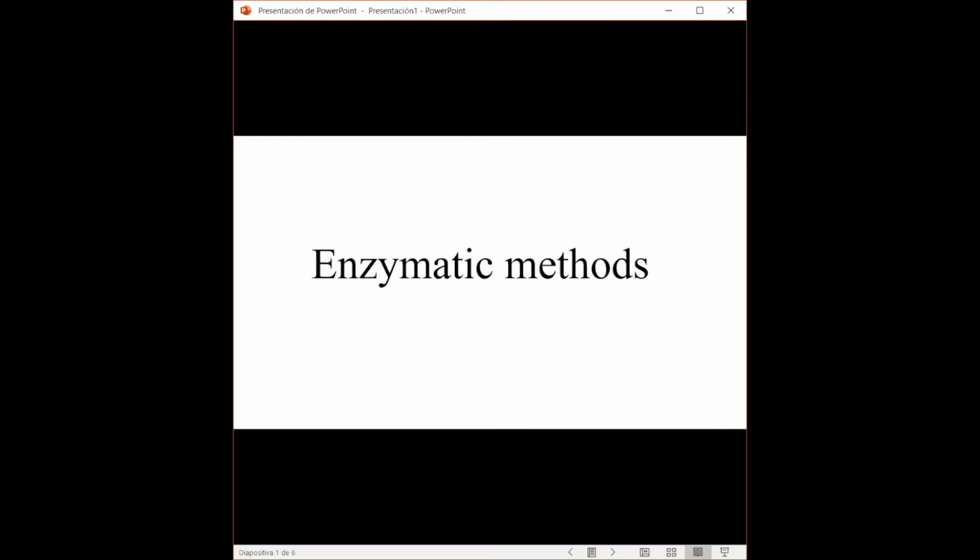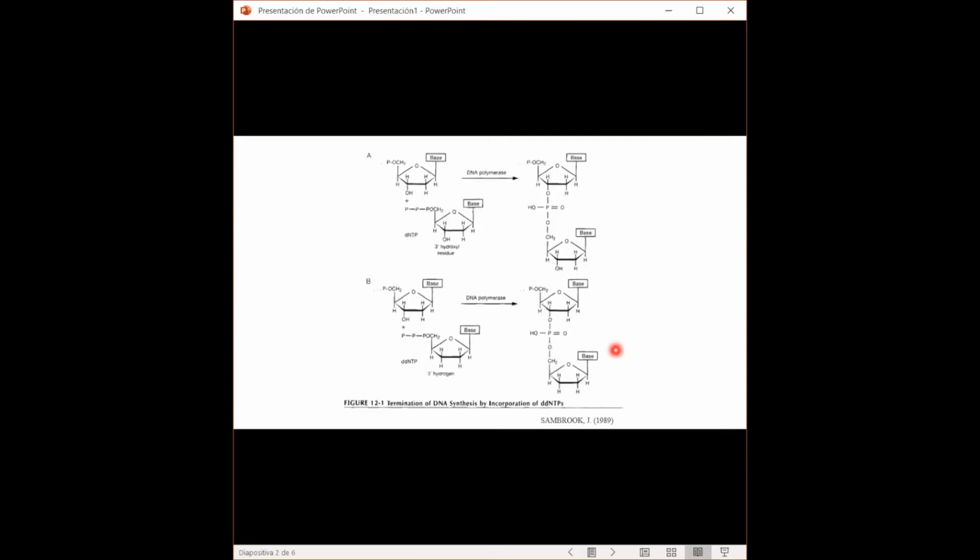In 1977, Sanger's enzymatic sequencing emerged. This enzyme technique involves making many copies of a region of DNA, based on the controlled interruption of in vitro DNA replication. Certain reagents are required to perform this sequencing: DNA polymerase enzyme, a primer, the four nucleotides of DNA, the DNA template that will be sequenced, and the special ingredient, the dideoxynucleotides or chain terminators for the four nucleotides, each with a marker in order to be recognized later.